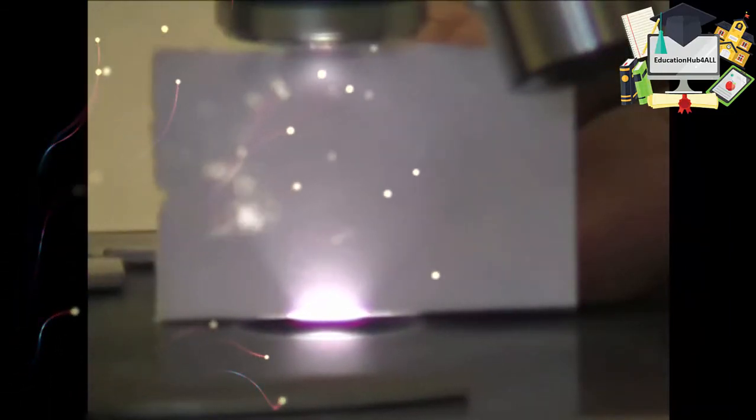With the lever at the front here, you can adjust the size of this cone of light. Each time you change the objective lens, it's important to make this adjustment so all of that light is going into the lens.